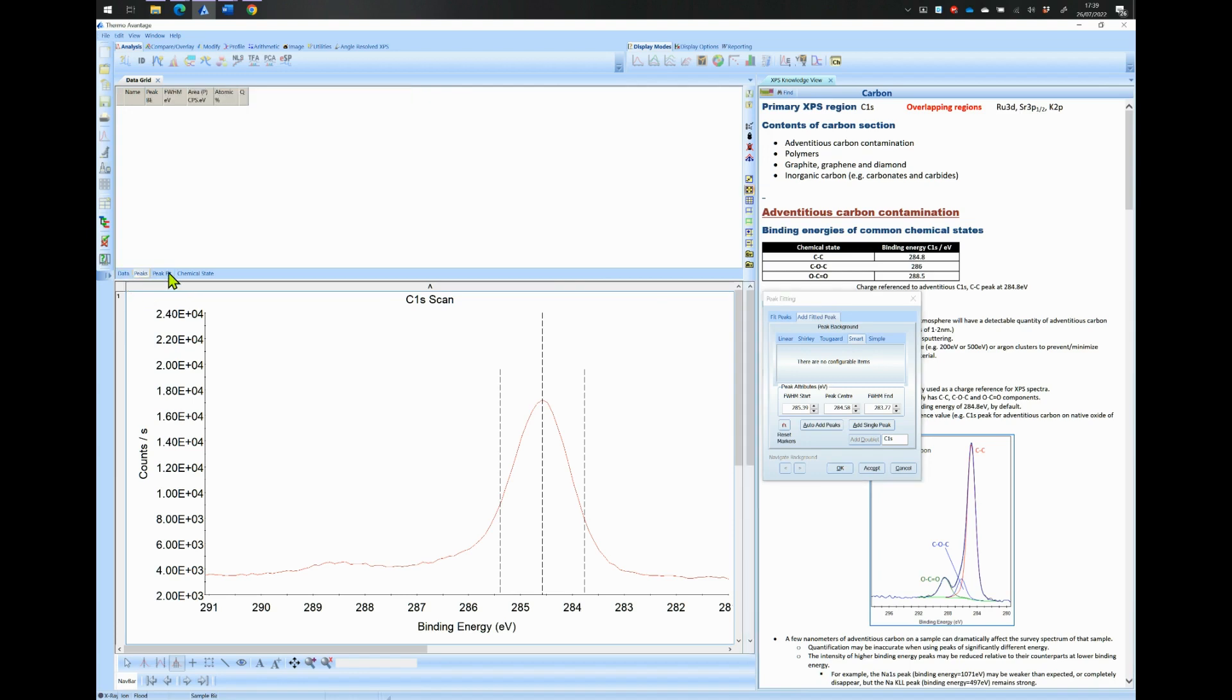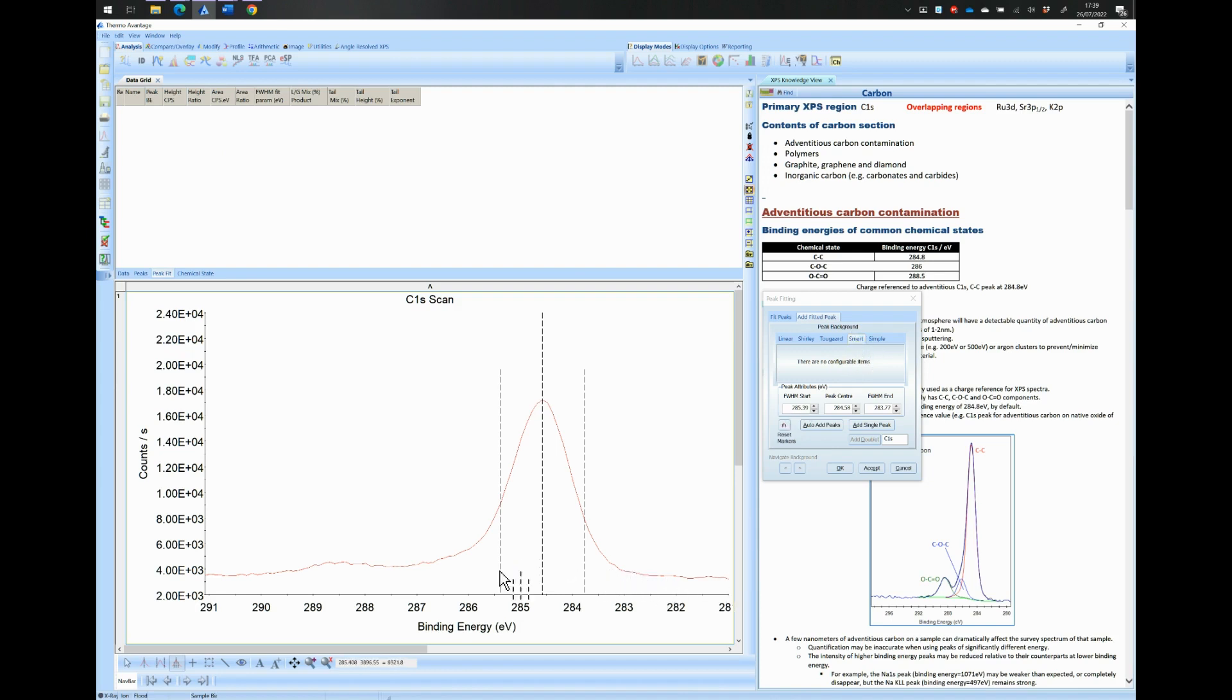The background type that we will select for our peak fitting is the Smart Background. It will fit a Shirley background if the background is higher at the high binding energy side and it will fit a linear background if the background is higher at the low binding energy side. In most cases, the Smart Background is the most preferred option.